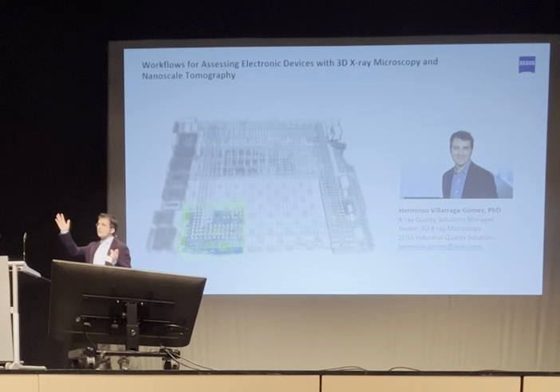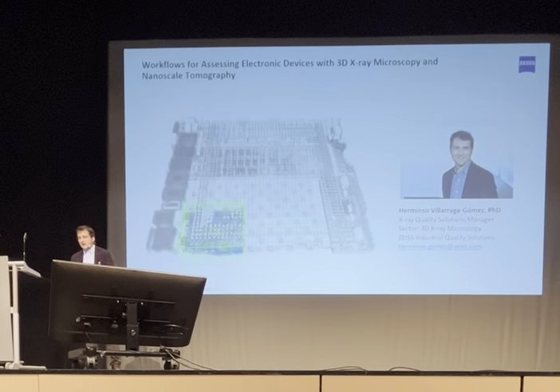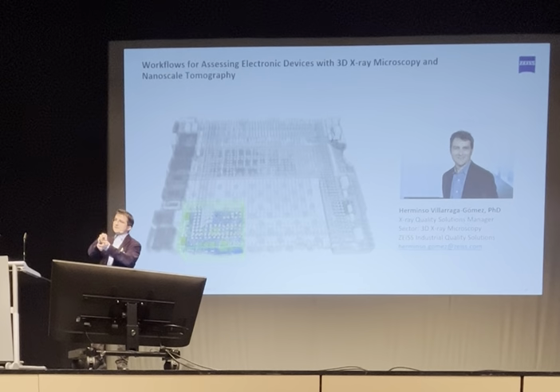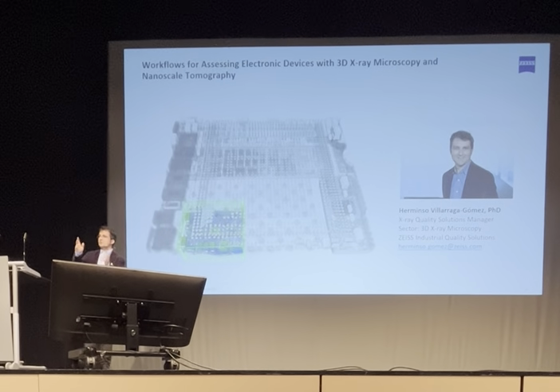If you go over 225, then it would be more of a problem. There are specific details, and I can refer you to a paper which explains it, because it's a little more complicated what is happening inside with the X-ray. It can create some transitions that break some of the connections.